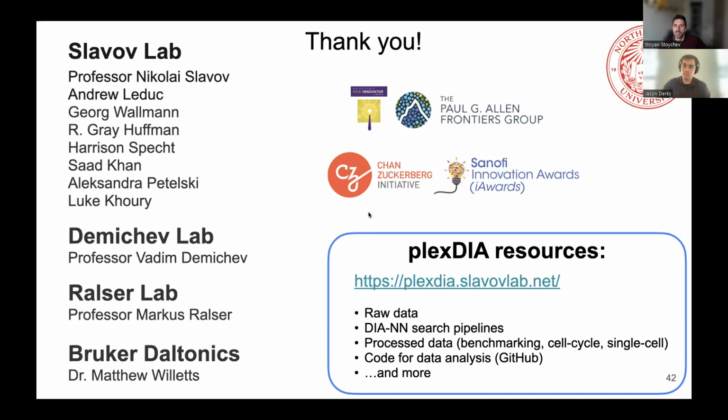Okay. You didn't have to shift it up. I think for your label-free DIA method, you had a slightly lower mass range, right? Right. Yeah. So for the bulk analysis that we did, we started at 480 and then went to, I think, 1480 or something like this. And if I were to redo that, I would probably go down a little bit more. But they're both fine.